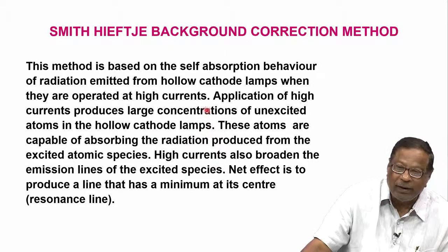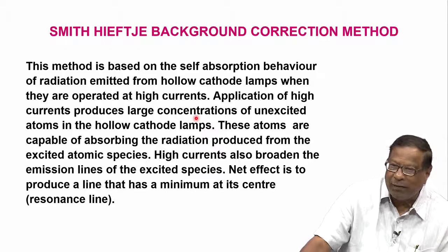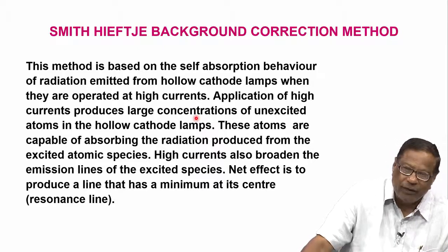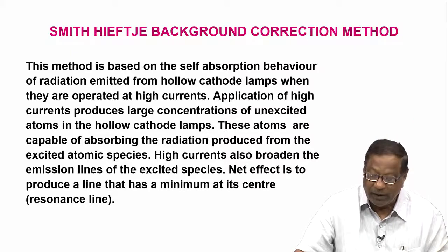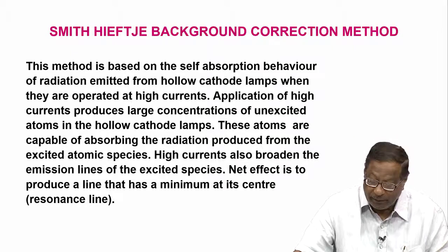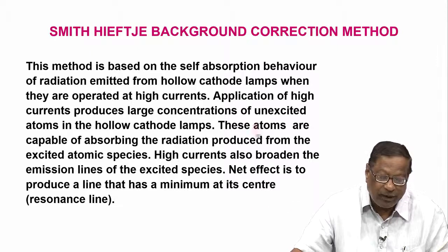So, it is important for you to understand the mechanism of background correction of deuterium lamp, the mechanism of background correction of Zeeman effect, and the mechanism of background correction for the Smith-Hieftje background correction method. Relatively, Smith-Hieftje background correction is somewhat of recent origin, and very few instruments were available. Nowadays, quite a lot of instruments are available with Smith-Hieftje correction also.